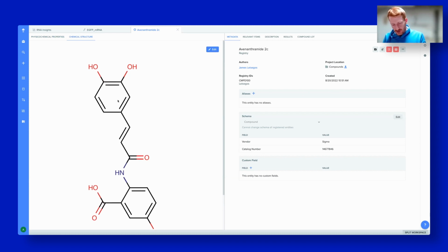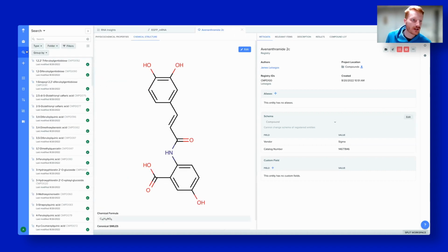Now, as you saw, we made it possible to find every RNA that had a particular monomer in it. In a similar fashion, we can also search every chemical structure or molecule we have for a particular substructure, right? A substructure search has definitely been something many of our chemistry-facing clients have been asking for.